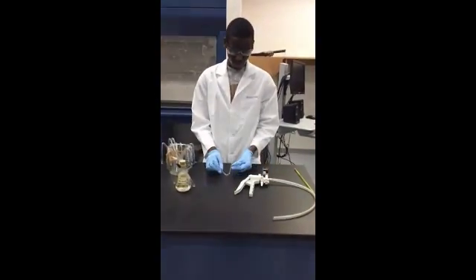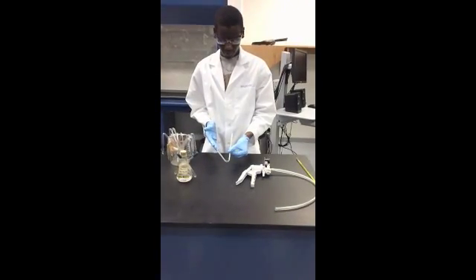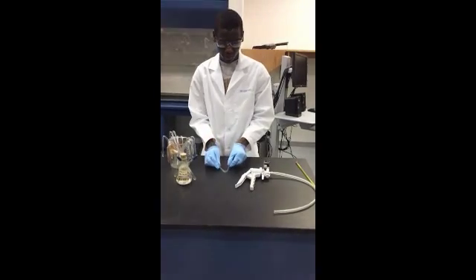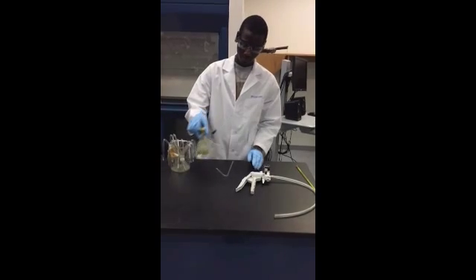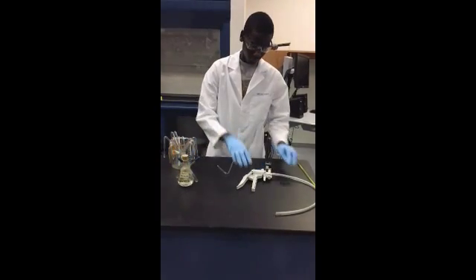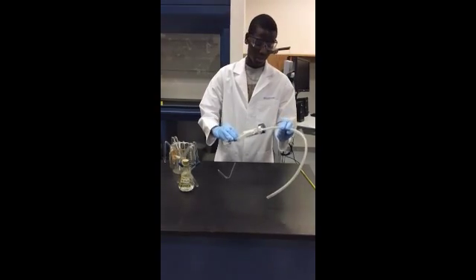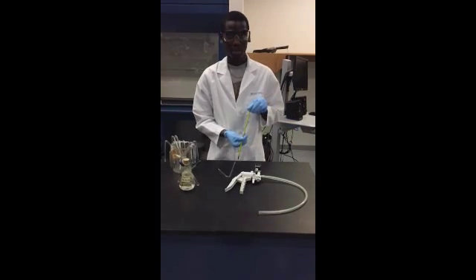In this week's experiment, you'll be using an isoteniscope. See how the isoteniscope has a sealed end and an open end. This will allow us to form our bubble for the experiment. You'll also be using liquid ethanol and a hand pump to vary the pressure during the experiment. And lastly, you will have a thermometer to take the temperature.